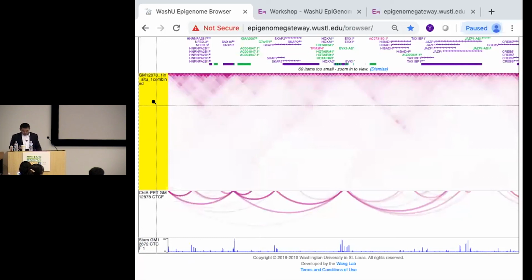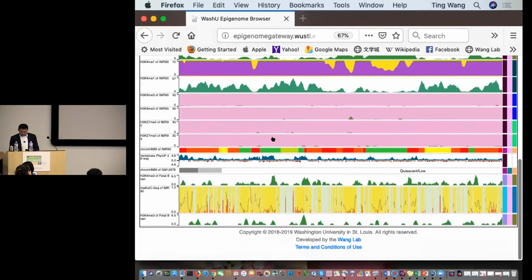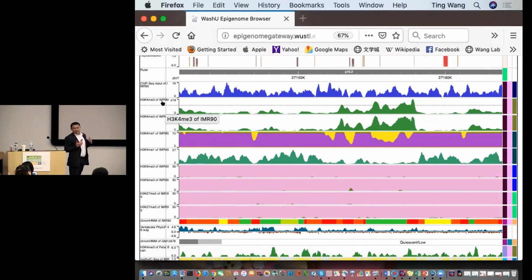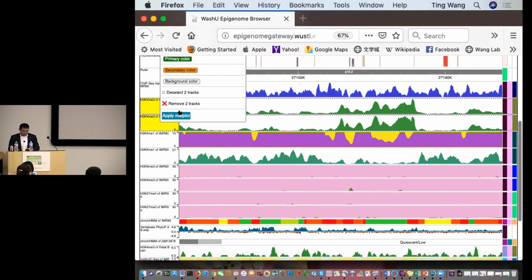So that's looking at Hi-C data. I think I do have another function I was going to show, but kind of forgot. So we're coming back to this view. I'm glad I haven't closed it. So there's a way, you still look at one track at a time with this, right? So we have a way of combining tracks, right? So for example, if you want to combine these 2 tracks, because sometimes you want to look at the contrast, you can apply something called matplot.